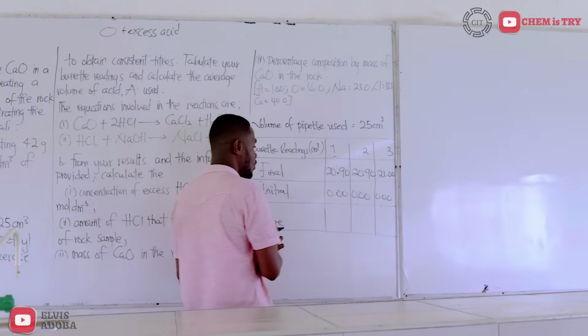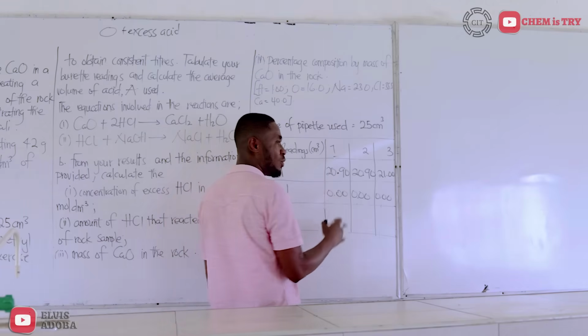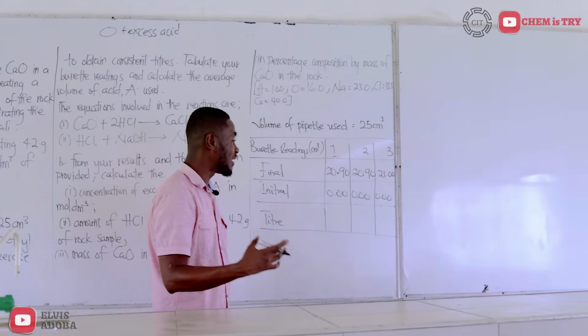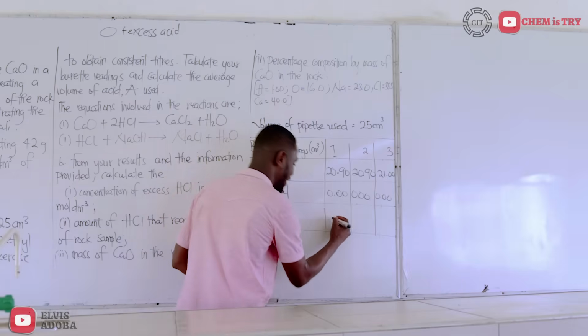The titer will be the final minus the initial. The reason why it is convenient to always start from 0.00 is that with that, there is no need for any calculation. So you just put down the values.